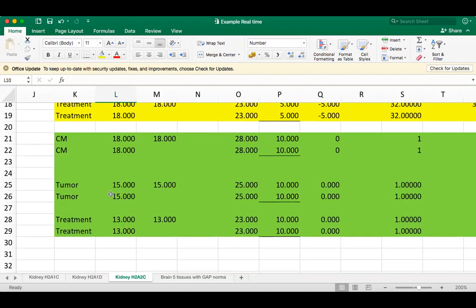So again, in case of tumor, there is more amount of DNA, which is 8-fold, and the difference is the same over here. And in case of treatment, the difference of 5 CT value is there for the internal control gene. So we can't really just say that the higher expression in case of tumor is there for this 25 and 23 CT value.